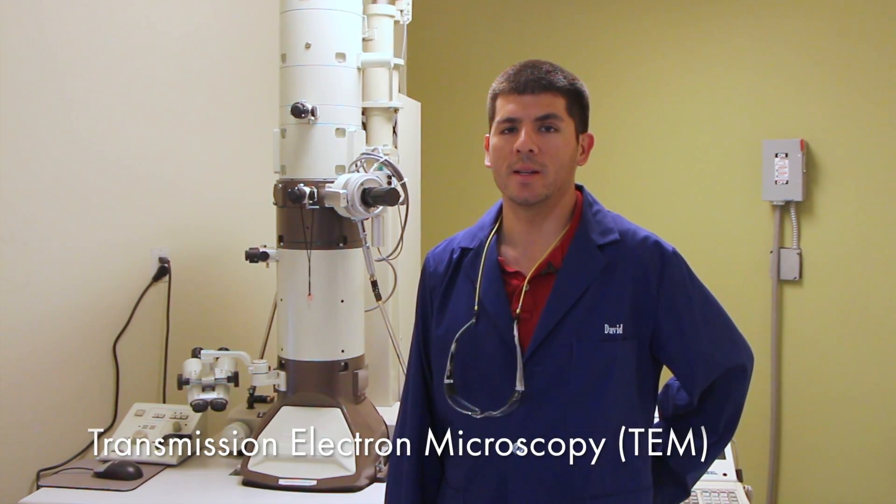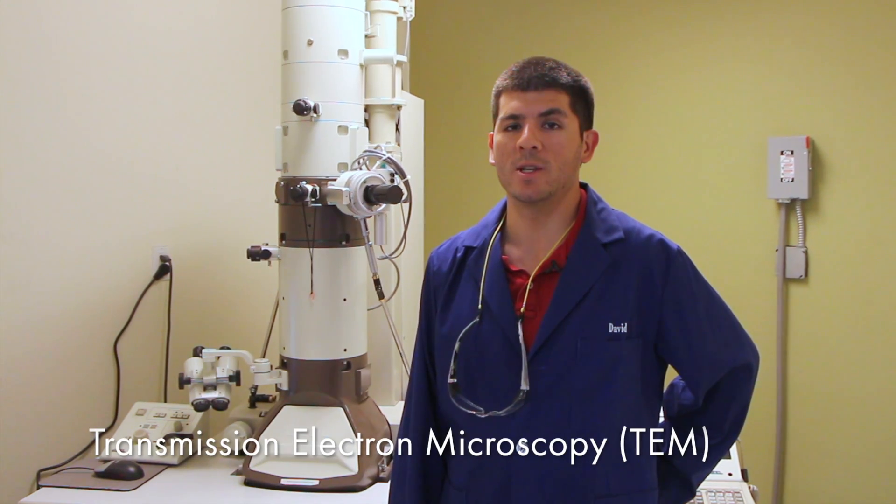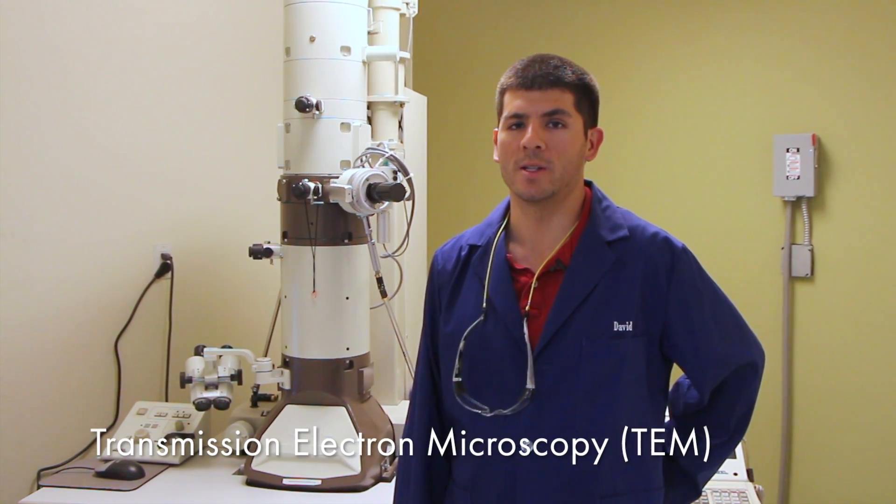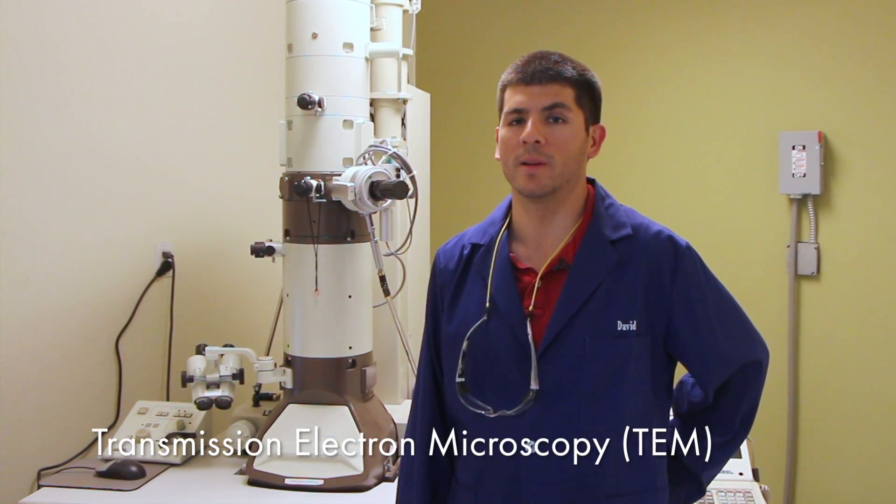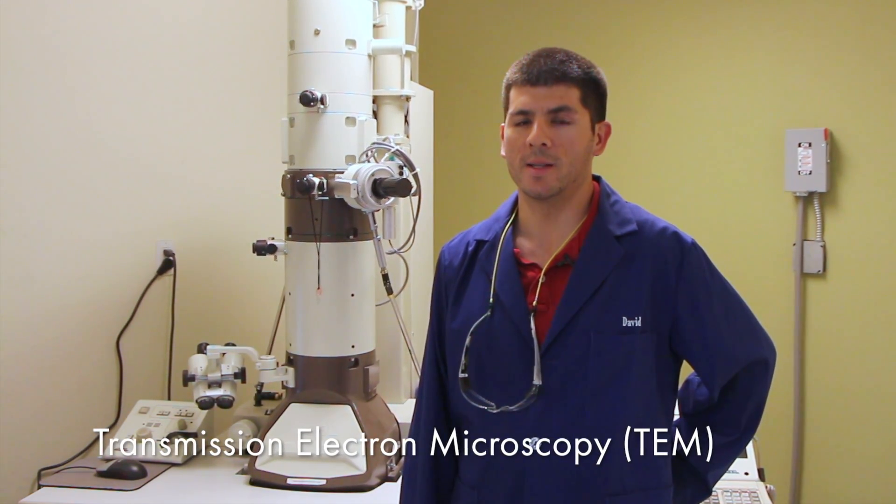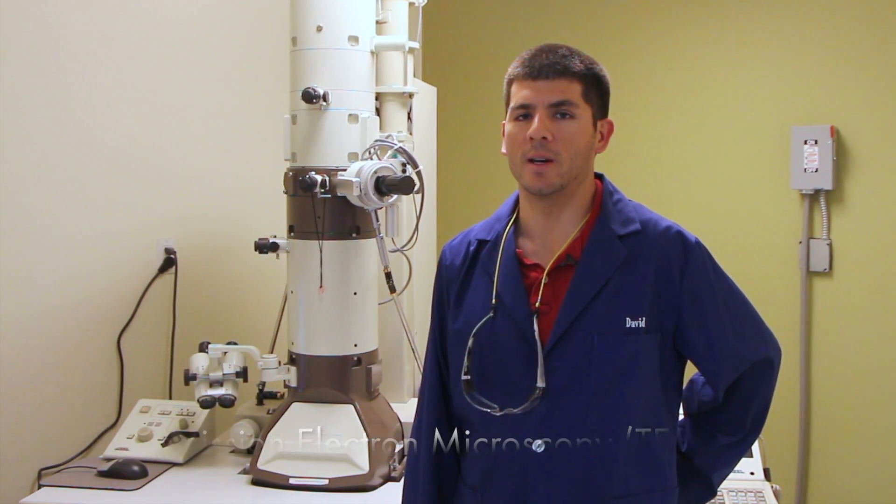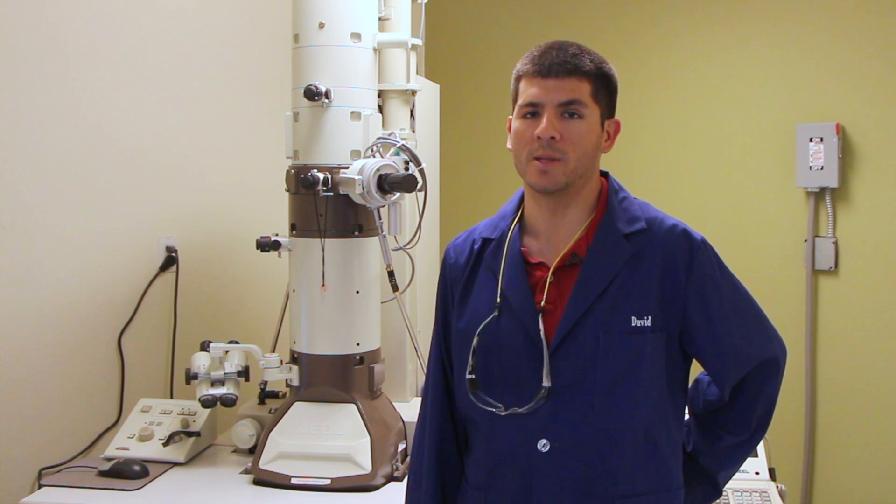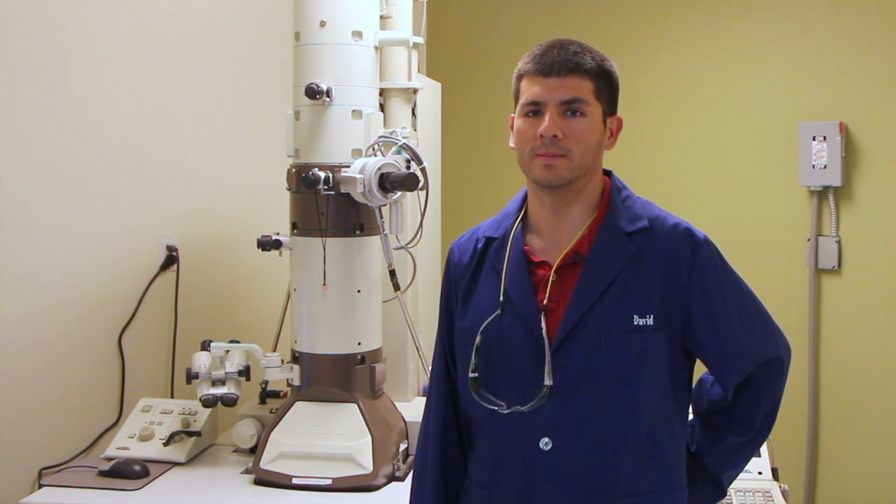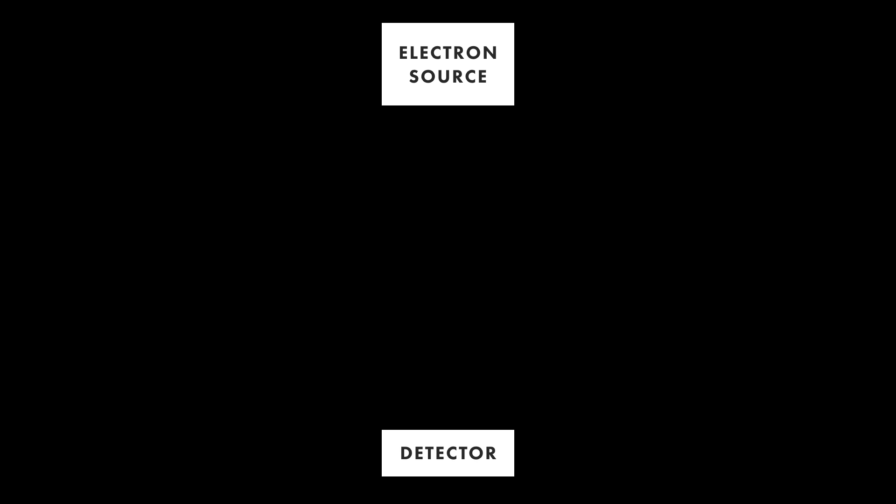TEM is a technique that is used to image materials that are smaller than visible light and thus cannot be seen on a conventional optical microscope. In a TEM, one side has an electron beam and the other side has a detector, in this case a CCD camera. In between is your sample, which is dried down onto a grid.